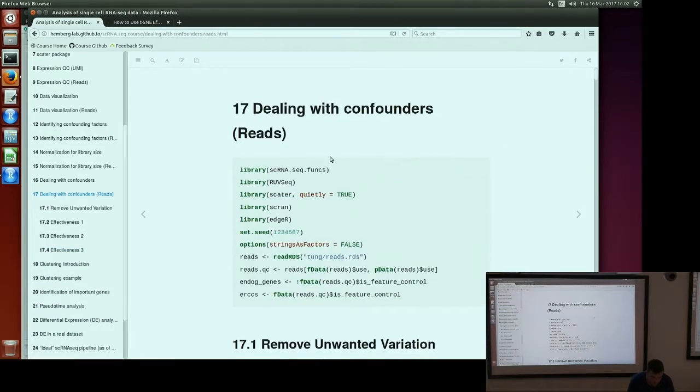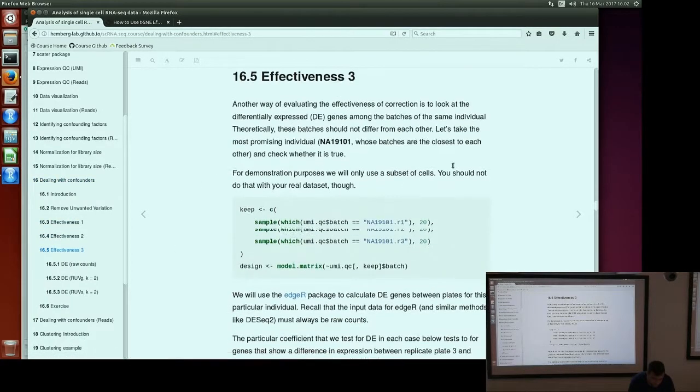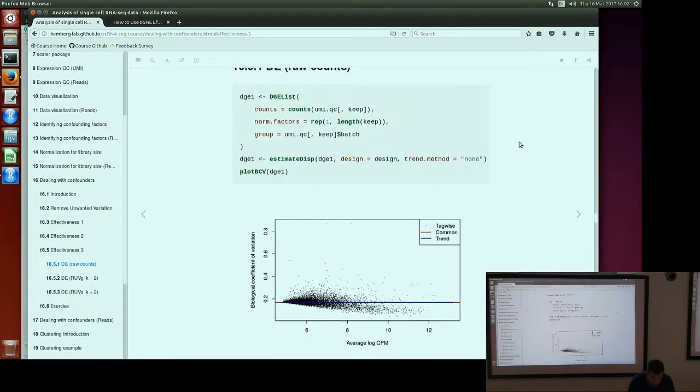And so the first step in the edgeR analysis is estimating the dispersion. So this is, in the negative binomial model, the variance for expression is a function of the average expression for the gene and this parameter called the dispersion parameter. And for modeling expression appropriately, the crucial part, it turns out, is estimating this dispersion parameter, which defines the mean variance relationship.